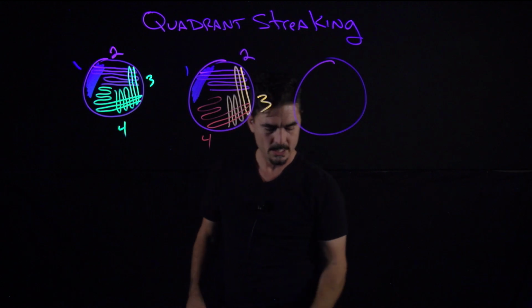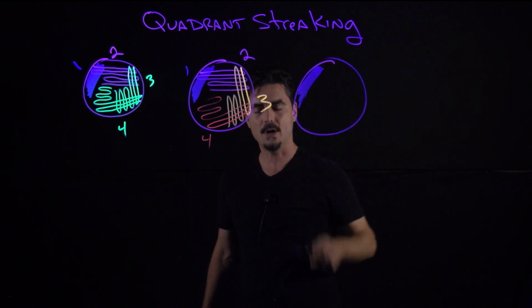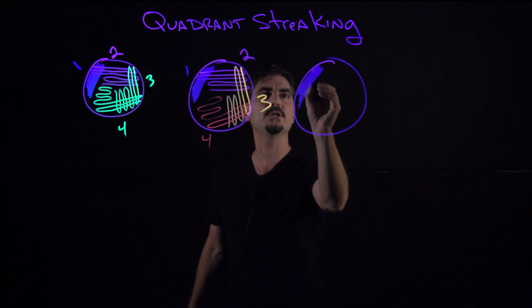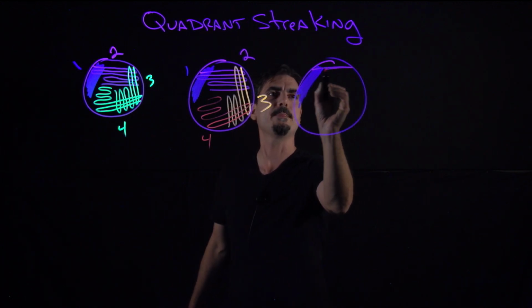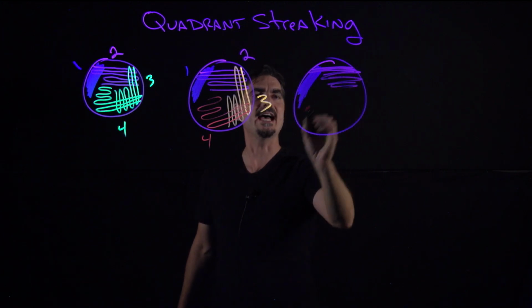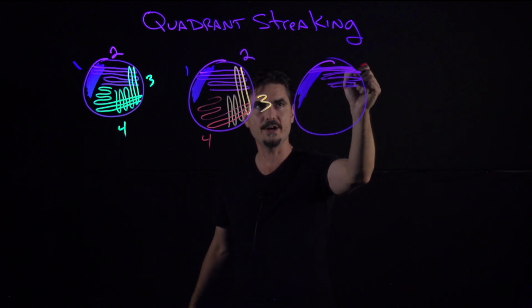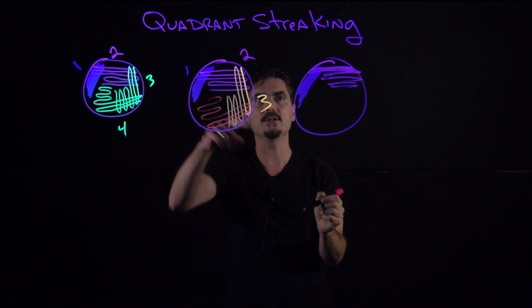Okay, so for example, this is typically an okay one. But then sometimes what people will do is they will essentially do something like that. And now that's bad, because you see how you're going back and forth over and over and over, whereas this, you have parallel lines.